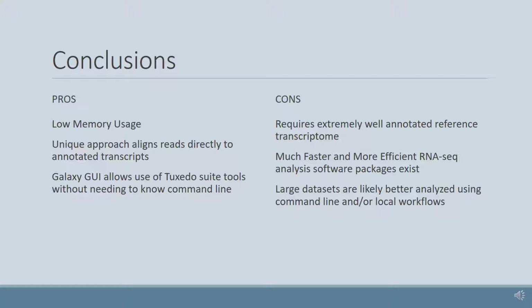There are other software packages like Trinity that will do that for you as a de novo assembly. And like I said, this came out in 2009, and as always, software improves dramatically with time, so there are much faster and more efficient software packages out there. Trinity is one of them. Sailfish is one, Kallisto, but those are not as well documented. But just trying to show that tools are always developing, and they are working on TopHat 3 that'll utilize some of those new approaches.